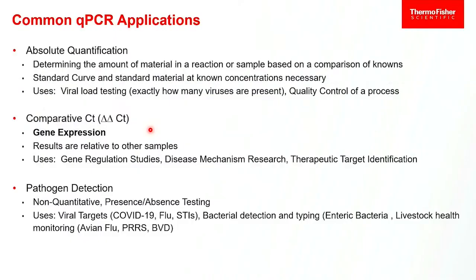You can do it faster in qPCR because you're simultaneously making and detecting. Whereas when you do PCR, you have to make, and then when you're done, you analyze. So that's the difference.